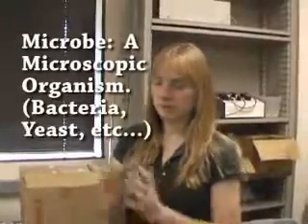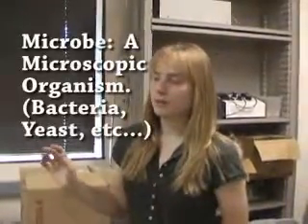This is where we start our experiment process. Ethanol is produced by microbes, many different types of microbes, that eat up sugars or starches that are available in a substrate and produce ethanol as a waste. We're working with 3 different microbes, and it's 2 yeasts and a bacteria. If you've ever made bread, you know that at one point you have to add yeast to the mixture, and as that's working, the yeast produce both gas and ethanol. The bread rises, and when you bake the bread, the alcohol goes away, and you're left with a nice big poof of bread.